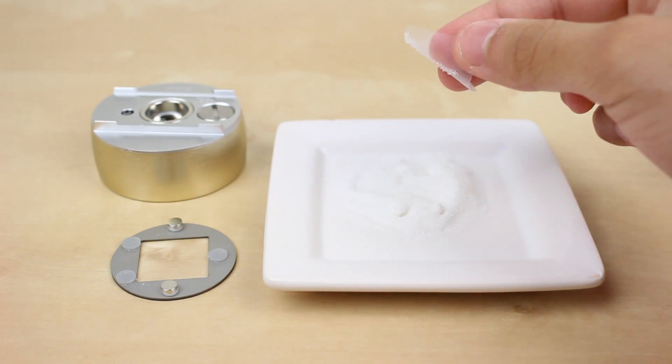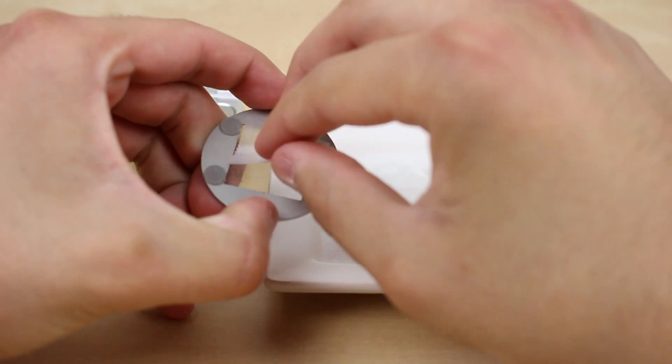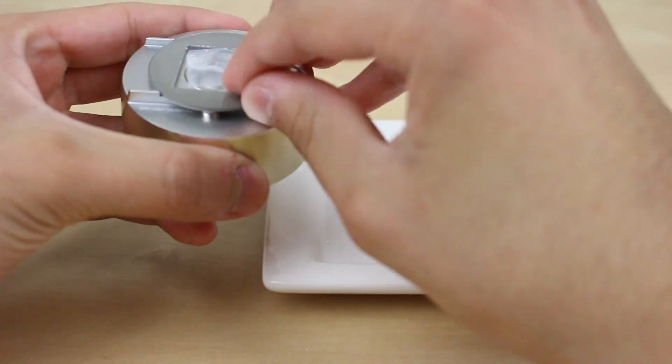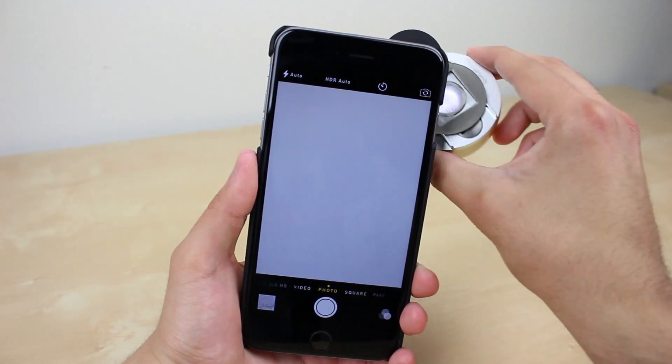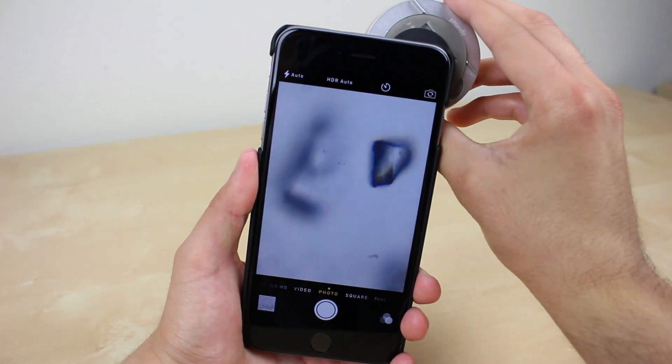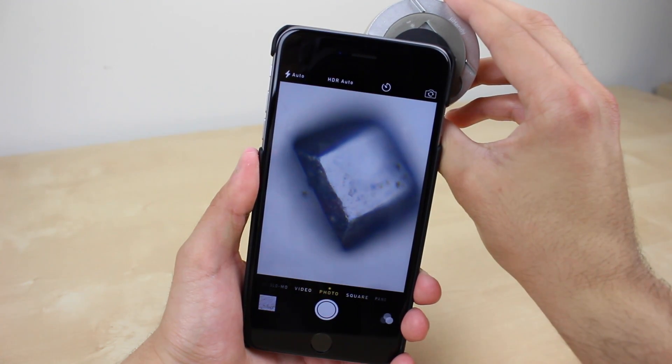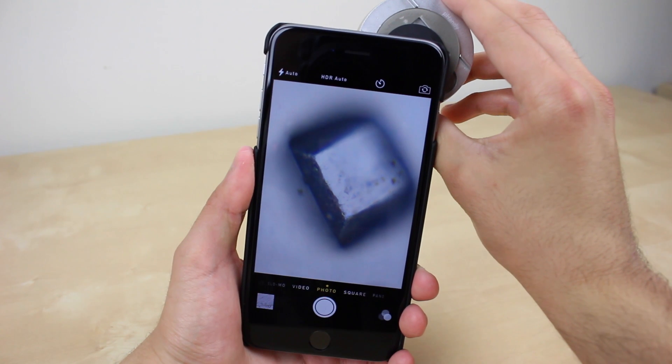If you want to capture something like pollen or grains of sugar, you have the option to do it with a piece of tape, which makes it easier to obtain the material. Then stick it to the U-Handy slide, which is a holder and slide in one, and attach that to the light source — and you're done; you can look at it from your phone on the go.